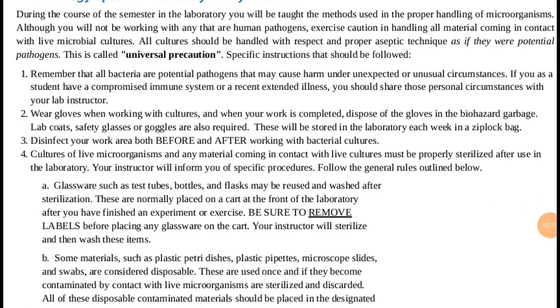Here we want to avoid transferring bacteria to other places. Your instructor will always inform you of these specific procedures, and therefore you should follow the following general rules in the microbiology lab. Glassware such as test tubes, bottles, and flasks may be reused and washed after sterilization.